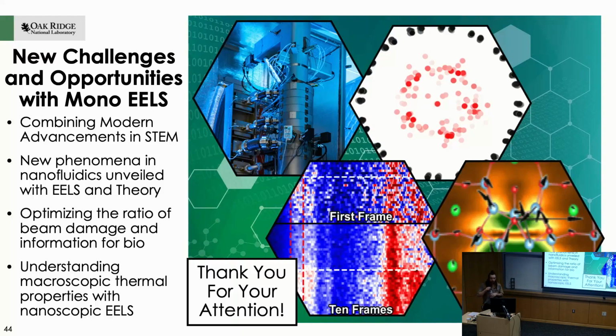We like to do a huge number of very short dwell times because when you're at super high energy resolution, you're really sensitive to stray fields in the microscope room. So your zero loss peak will actually bounce around very quickly. What you don't want to do is one really long dwell time measurement, because then all that bouncing around will just be integrated into your signal. But if you do a bunch of really fast measurements, you can then correct each one individually after the fact and get the native resolution of the instrument. And it's all 60 hertz noise that's really killing us. So we can actually go faster than the 60 hertz noise by doing sub-millisecond acquisitions.